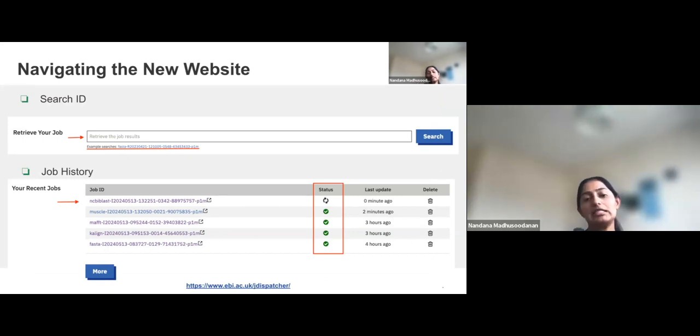As you can see here, if you want to retrieve your result, you can provide your job ID here and it will give you the result. It's equally useful to our programmatic users if they want to visualize their result. You can only retrieve one job at a time, and make sure that you provide a valid job ID. We store your results only for a week from the submission, so make sure that you download them if you need the output for later.